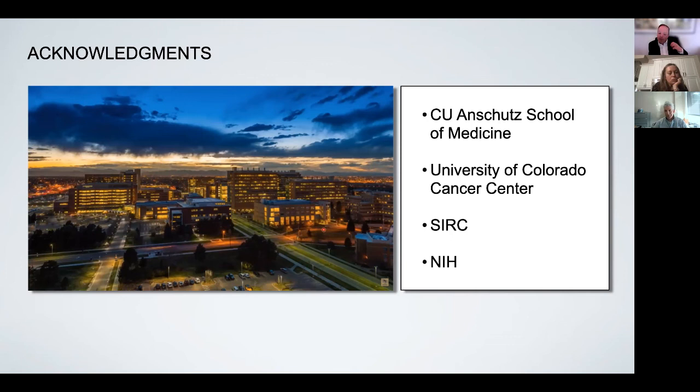So we are perfectly capable of doing single particle cryo-EM on campus. We can definitely use our scope for cryo-electron tomography, but it would not be the ideal instrument for that. So the hope is that at some point we will have a high voltage energy filter microscope and we will be able to image larger specimens like cells.